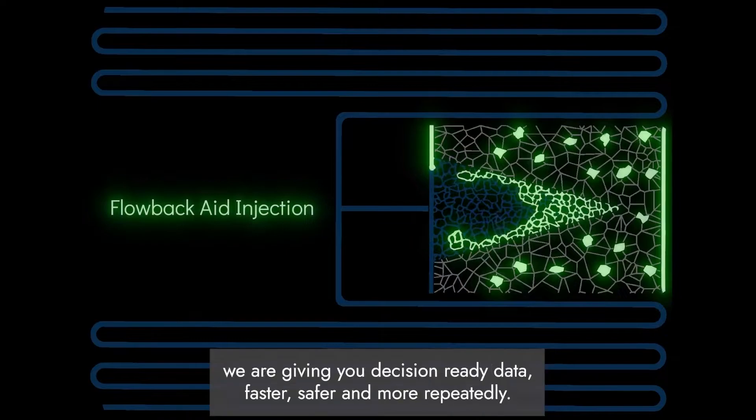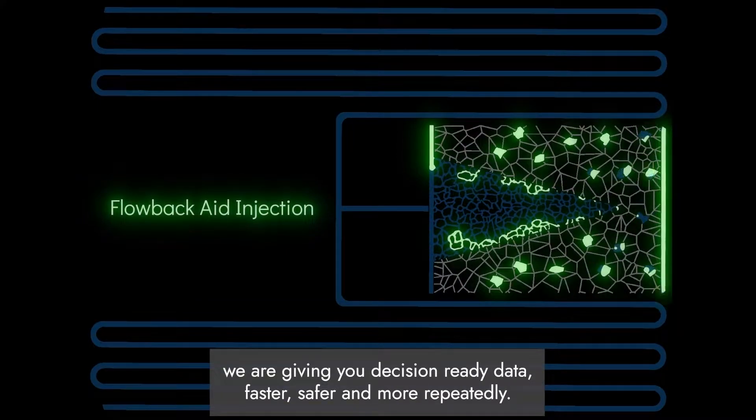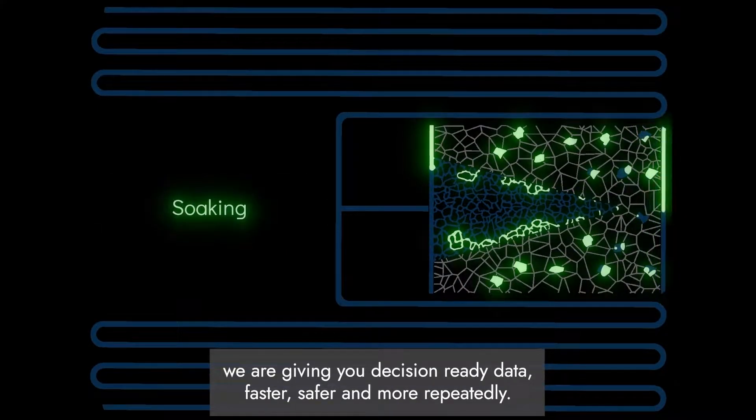At Interface Fluidics, we are giving you decision-ready data faster, safer, and more repeatedly.